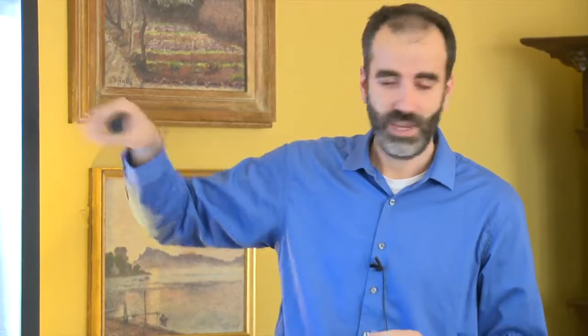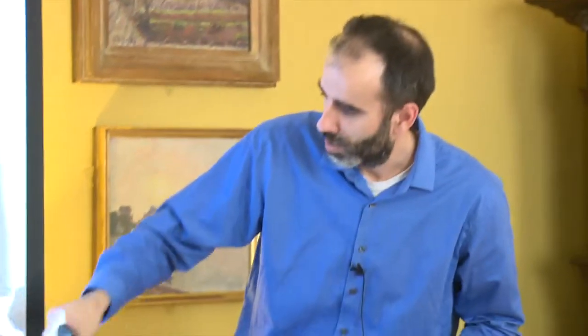So that's a 200th of a hair, right? And then we give little bits of energy and we evaporate atoms one by one. There will be a detector that will tell us exactly what atom left the sample, and we can reconstruct it in 3D, right? So we get a 3D picture. Because I'm running out of time, I'm going to the problem.